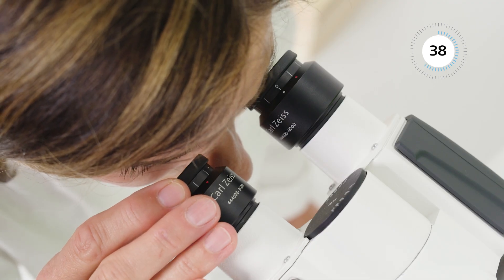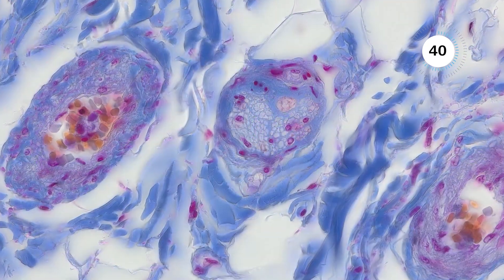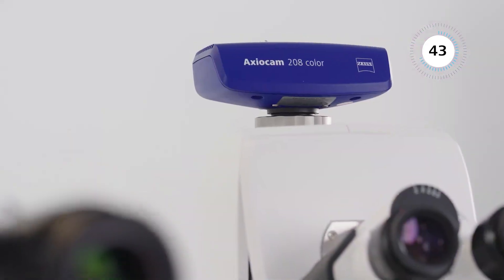Axiocam 208 provides 4K resolution and high-quality images for documentation of your clinical findings.